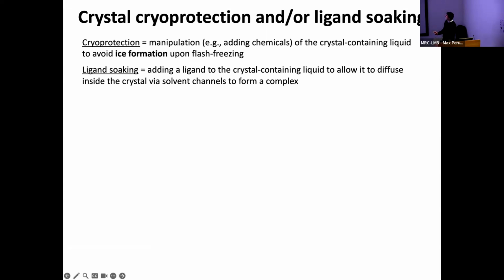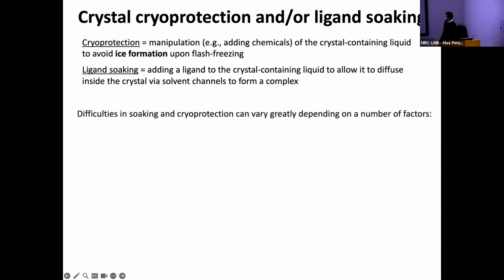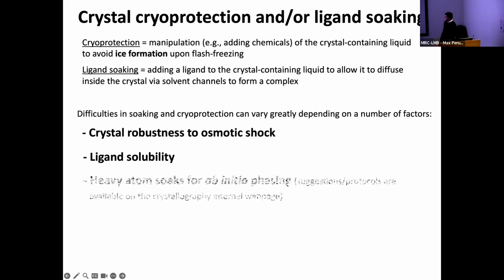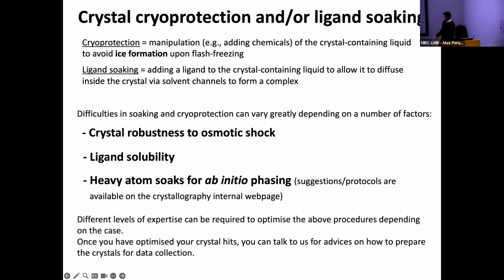We can use the same procedure to add a ligand into your crystals, for example, if you're doing some drug discovery. Difficulty in soaking depends on your crystals, really. If your crystal is very robust to osmotic shock, then it's going to be easy. If your ligand is very soluble, so you can use a high concentration of it, it's very easy. Heavy atoms also need to be soaked in, but this is becoming less popular now that there is AlphaFold. I will show you later. Different levels of expertise are required, but if you've never done it, don't worry, we are there to help you.